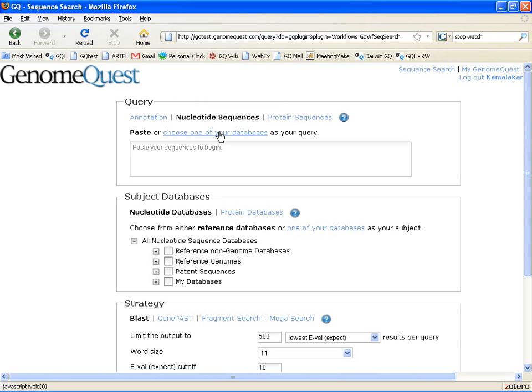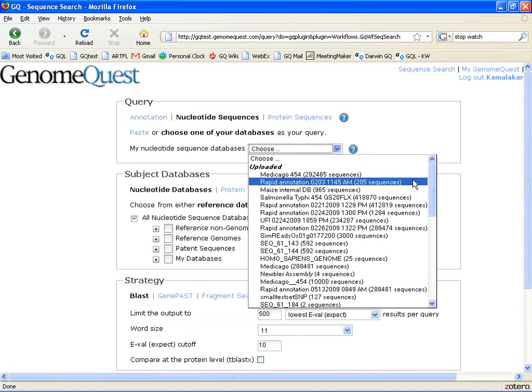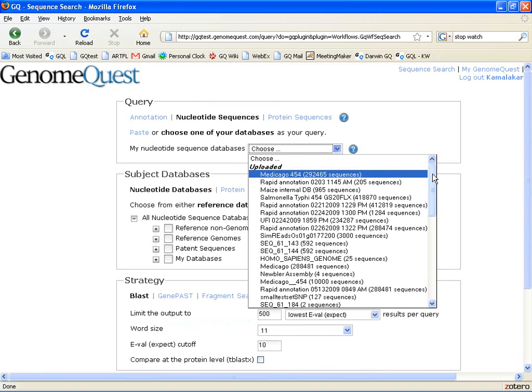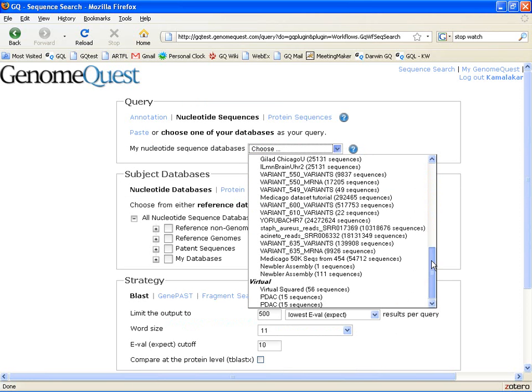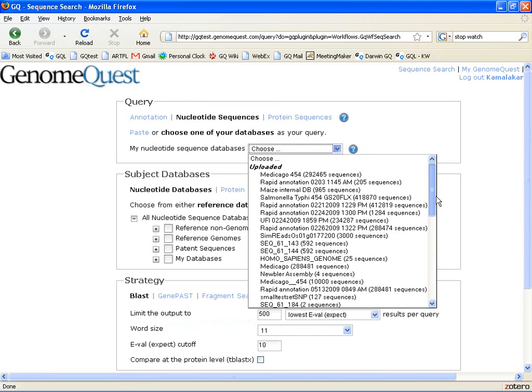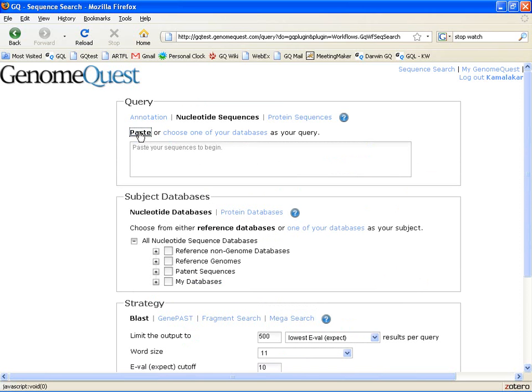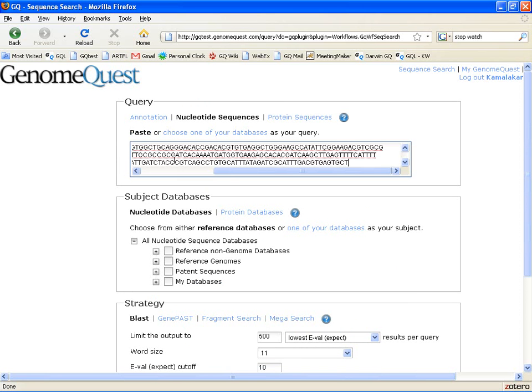You can actually choose to run the search against an entire database, whether it is one of the databases you uploaded or a virtual database that you have saved. In this case, we only have 10 sequences, and the easiest thing to do is just paste them in.